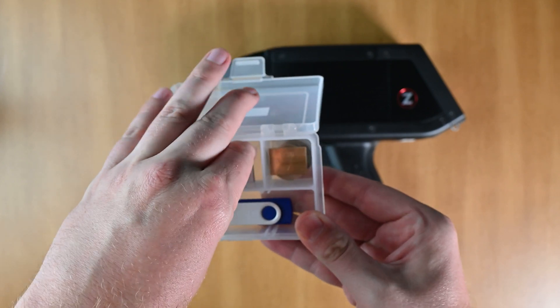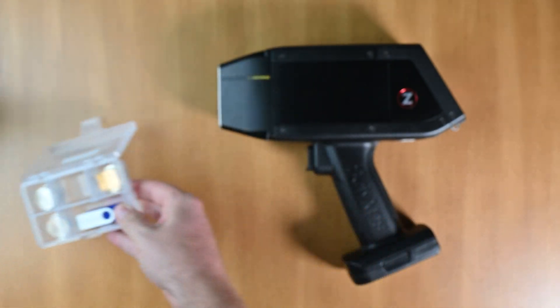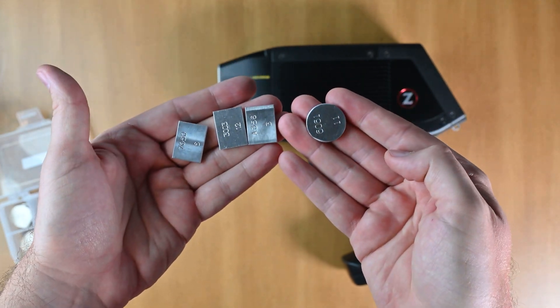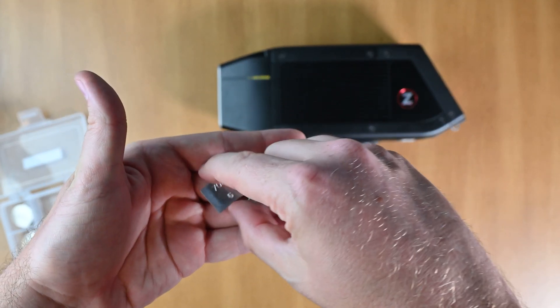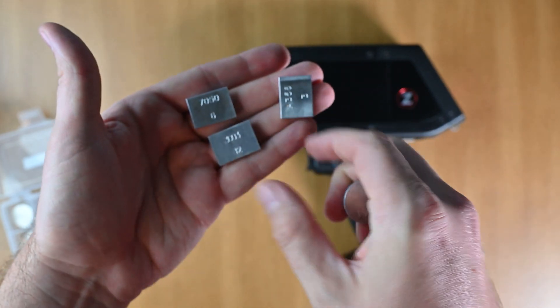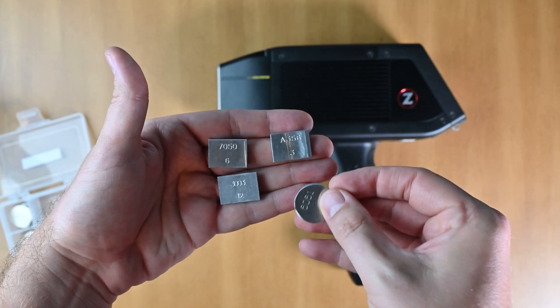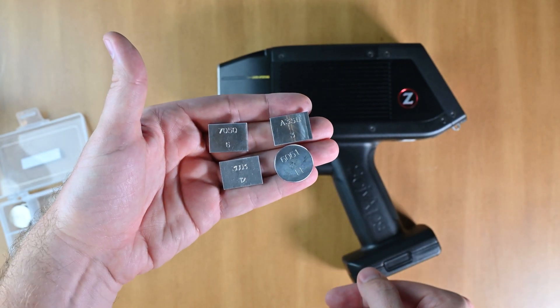In this case I'm going to take out the aluminum — that's the most common use. Let's say I'm going to go shoot some aluminum today. I've got my 7050, my 3003, my A356, and my 6061 aluminum samples.